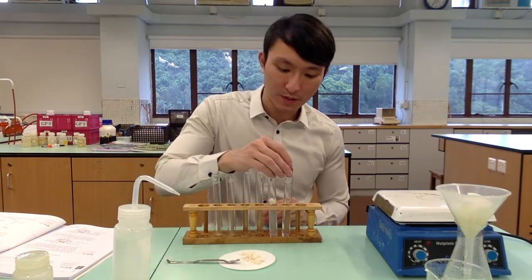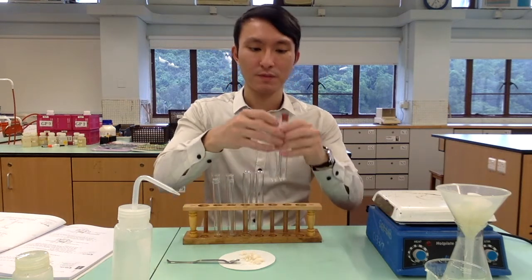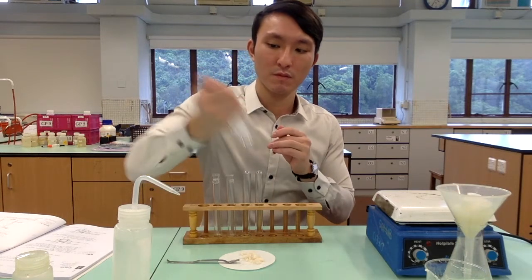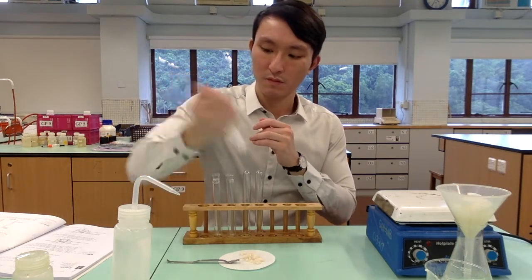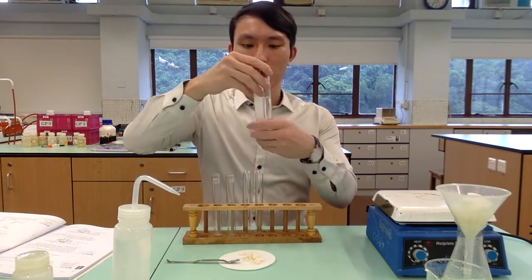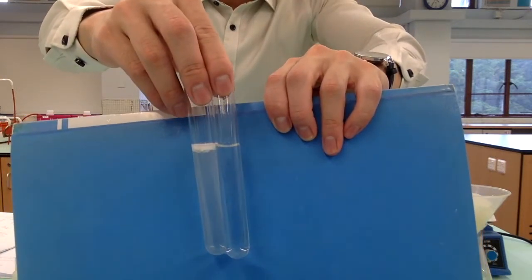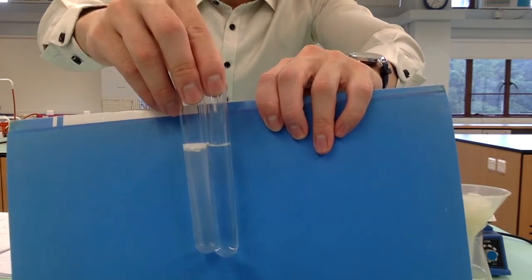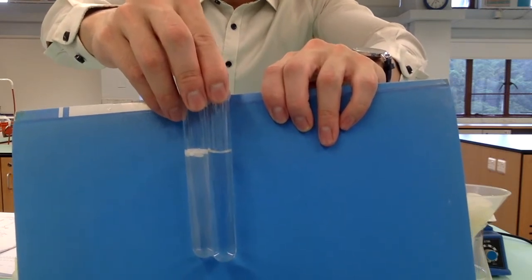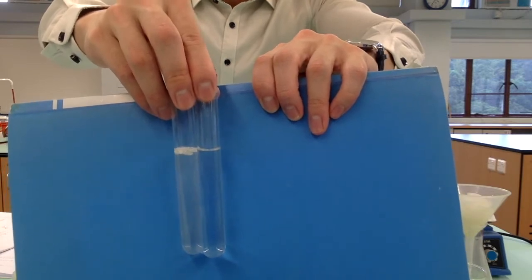Stopper the two test tubes. Shake the two test tubes. As you can see, the one on my left, your right, which is the distilled water, has no foam. However, the one on my right, your left, the one to which the soap has been added, shows a lot of foam.